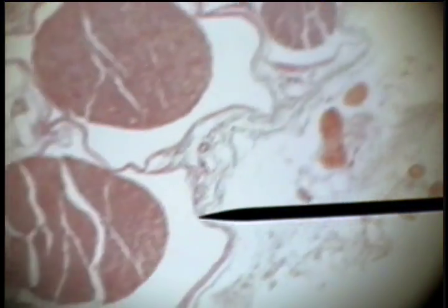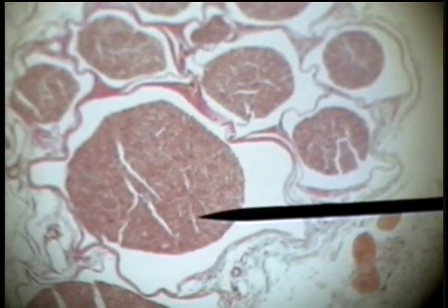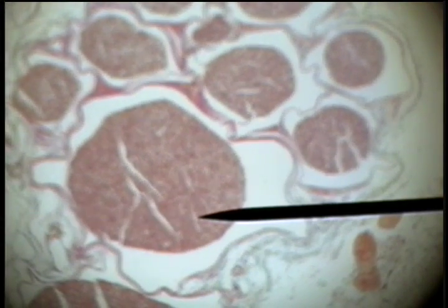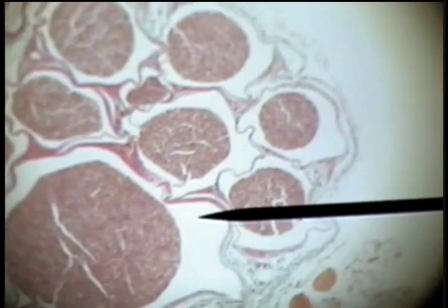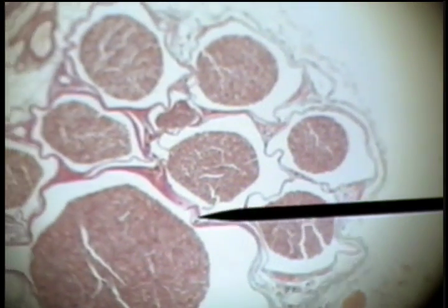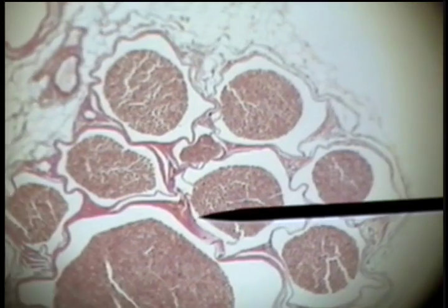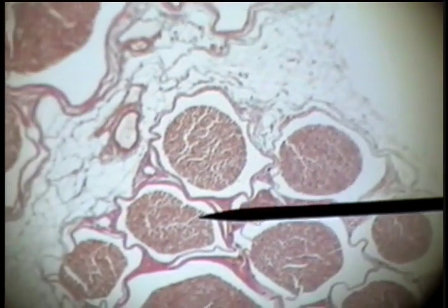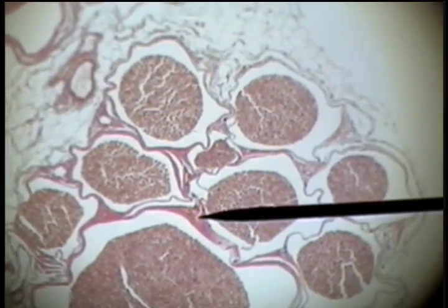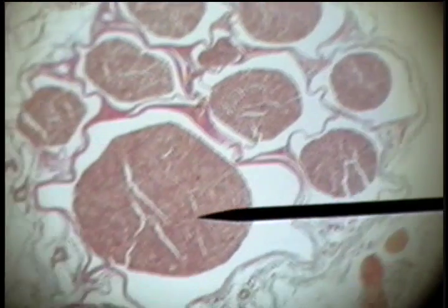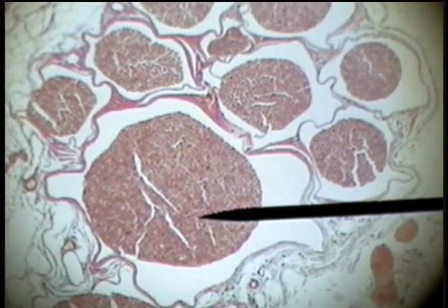We can switch to a cross section and look at the nerve on cross section. There is a covering around these nerves — this is the perineurium. These are bundles of nerves, and this is the perineurium. Here is the cross-sectional cut of the nerve, and we'll go look on higher power.